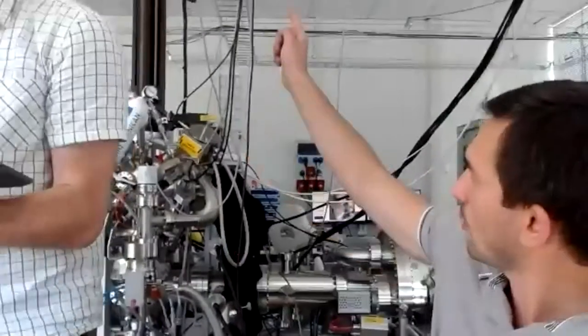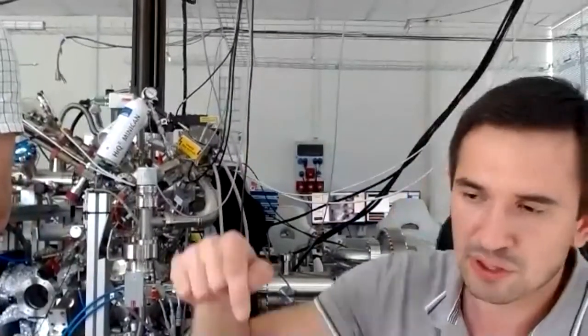So let's start. Maybe first, let's switch to the second computer, because in order to insert the sample into the NAP cell, we should first move many manipulators, and it is all controlled by computer. We have a software which operates all those manipulators. There is one tall manipulator, which we call the UHV manipulator. It moves the sample from the preparation chamber down to the analysis chamber.